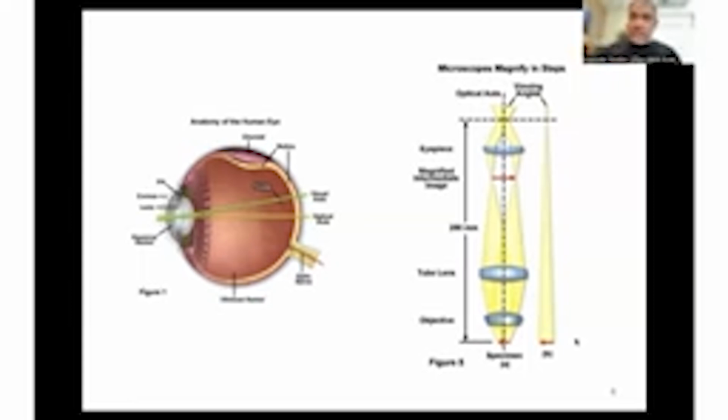And those kinds of principles are built into the microscope as well, where along with the light source, you have a set of objectives or lenses that allow you to magnify the object, and then there is a receiver at the end. The receiver at the end in a light microscope could be your eye, because it's actually looking at stuff. Or in the case of more advanced microscopes, it could be a recorder of some kind, right? Something that perceives the image.